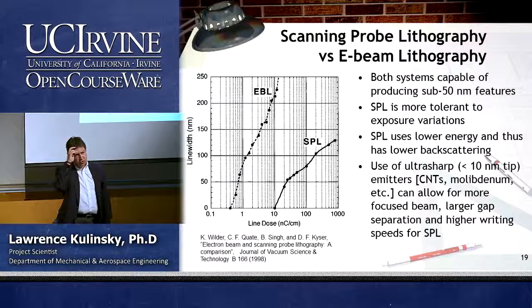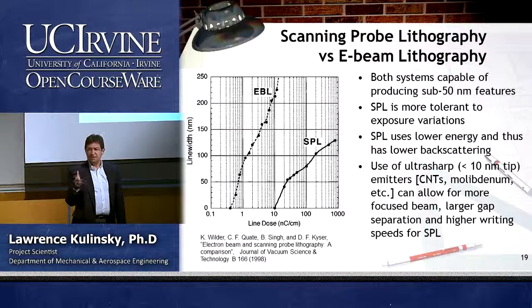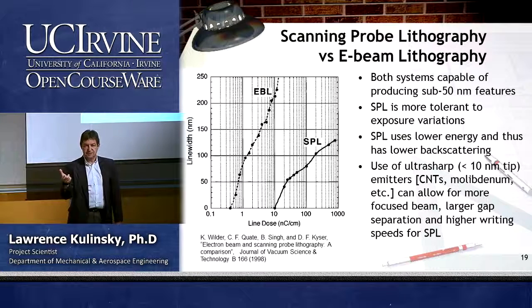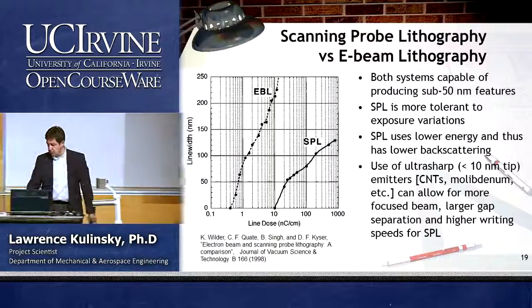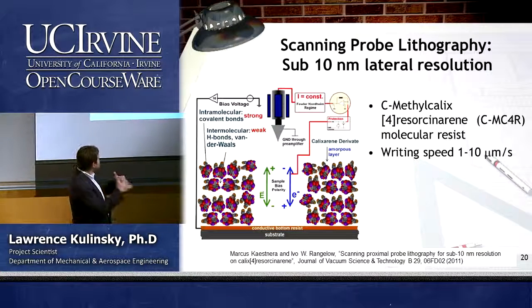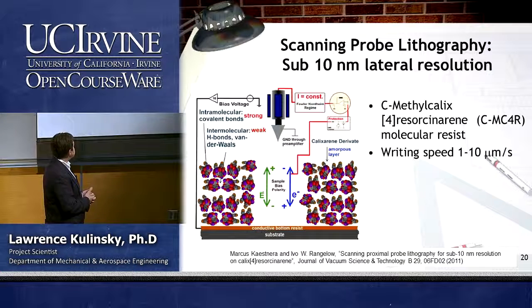Do you use a textbook in this course? No? So one picture I have seen is in Professor Madhu's three volumes. In the second volume, which discusses the topic of proximal probes, he has a very nice picture of the proximal probe tip, with the nanotube attached to the probe. So you can use a nanotube at the tip of your probe to improve your resolution. So we can have less than 10 nanometers lateral resolution. It's very important.